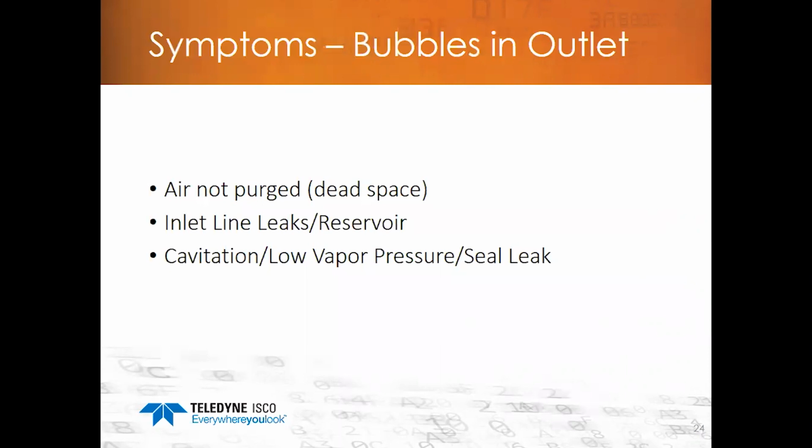You could also have a seal leak. Our seals, as we mentioned before, are lip seals. And when you're pulling a vacuum, the lip seals are not designed for pressure coming from behind the seal, and therefore air can leak into the pump.